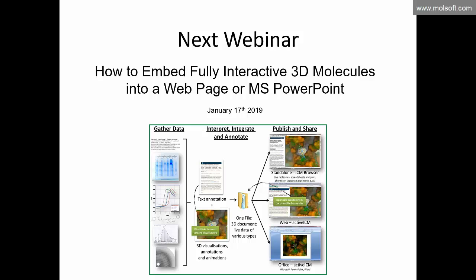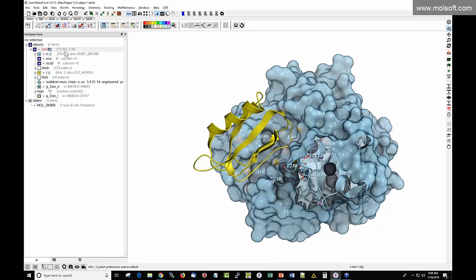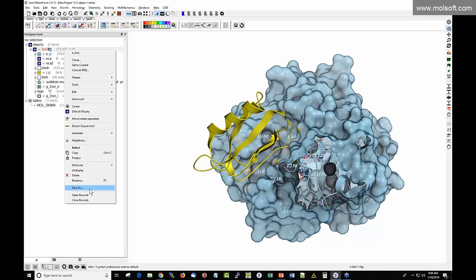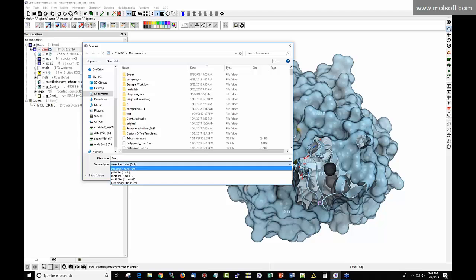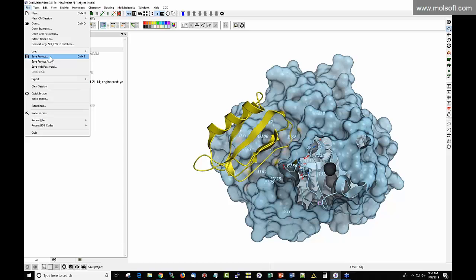On saving structures as PDB files: right-click the structure in the workspace and choose 'save as,' then select PDB from the dropdown list. File > Save Project saves in ICM/ICB format, which can be read in the ICM browser, on iPad, or on Android using the iMolView app.